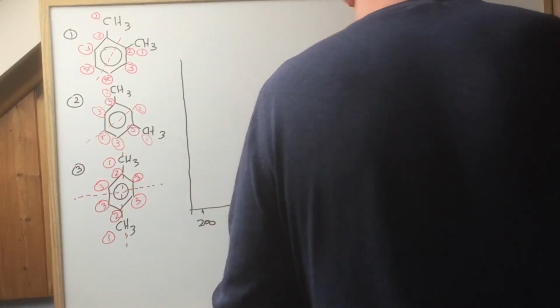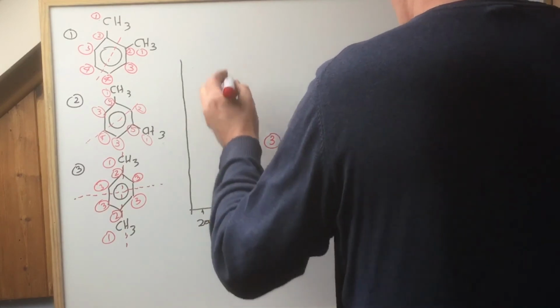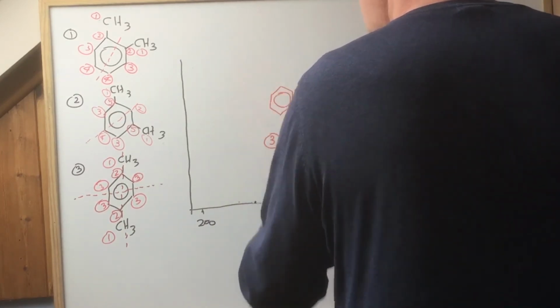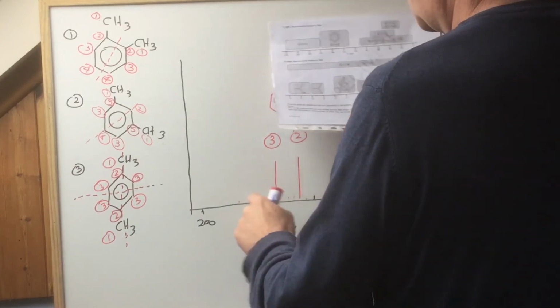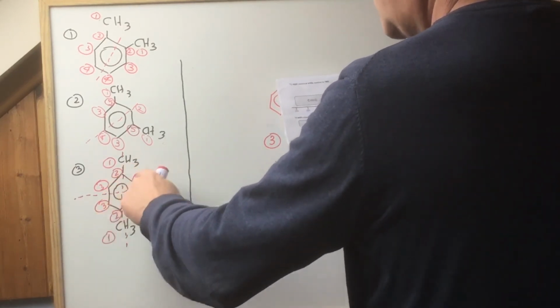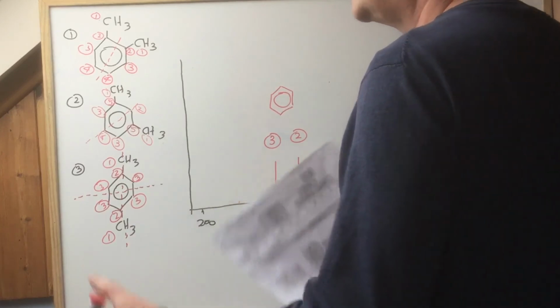So there you have it. Now just to be absolutely clear for anybody who's, you know, a bit slow. Be careful, Tim. All those there are in that range, but there's only 2 different sorts. 1, 2, 2, 3. Magic. There's your carbon-13, 3 environments, job done.